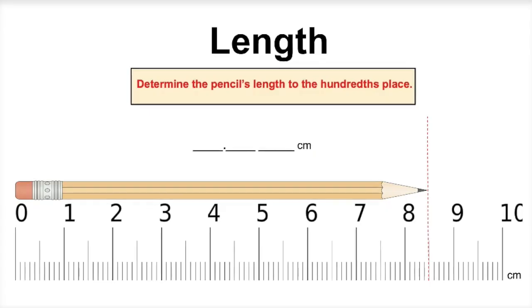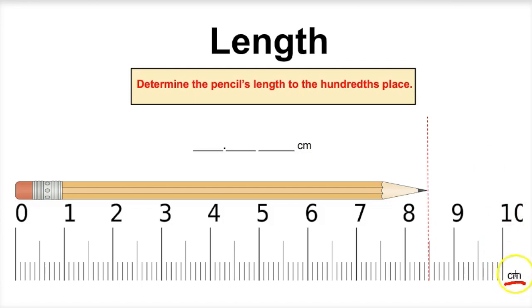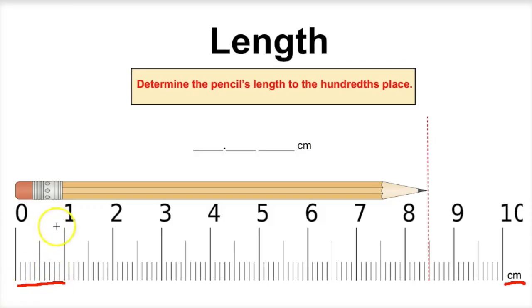When we start using the meter sticks and taking measurements, the very first thing we need to do is take a look at the unit in which the instrument is measured. For example, if we take a look at this meter stick here, we see that the measurement is calibrated in centimeters. Each one of these bigger lines represents a centimeter. We have 10 millimeters in between each centimeter, so the smaller little lines are millimeters.